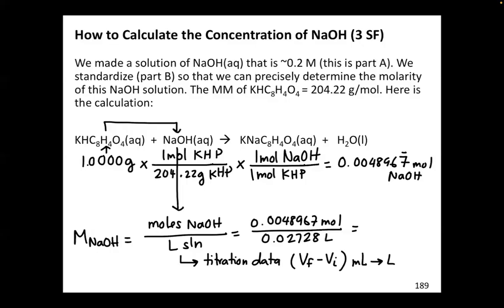Take the answer, divide it by 0.02728, and the molarity is, to 4 significant figures, 0.1795 molar. Did we do it right?